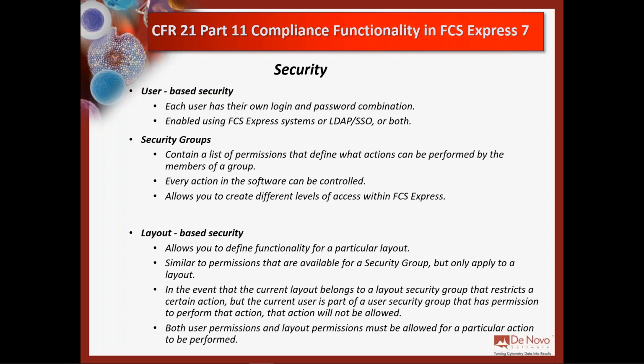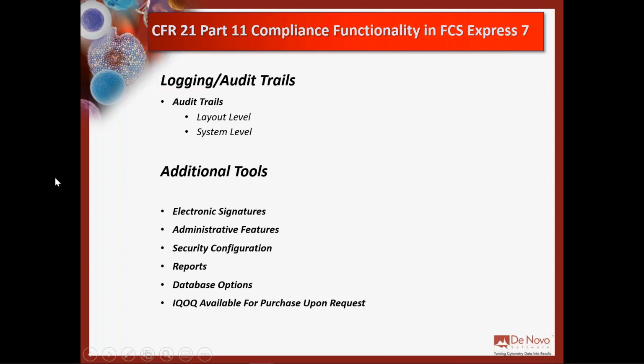And we can even refine it down to the template level in a layout. So if you have a specific layout where you really don't want people changing this, that, and the other thing, even though they might have permissions to do so generally, we can focus at the layout level and say you're not allowed to do this, but you are allowed to do that. And essentially what happens there is both user permissions and layout permissions have to both be allowed for a particular action to be performed. But we are going to look at that in just a second here.